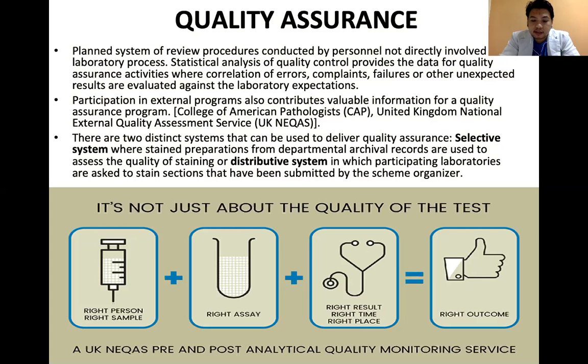In histopath, class, the quality control starts with receiving of the specimen, okay? Checking of the labels, okay? Logging in the specimen, okay? And starting the histotechniques, okay? Those are the procedures for the pre-analytical phase, okay?